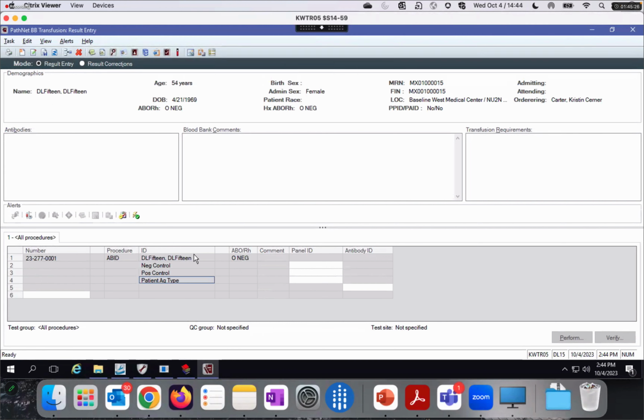All we're doing with this reagent cell groups build is generating these little groupers that we use for these types of procedures. Antibody IDs and antigen types are probably the two most common ones that use this, but there are others out there. So that's what we're going to be aiming for to create these.